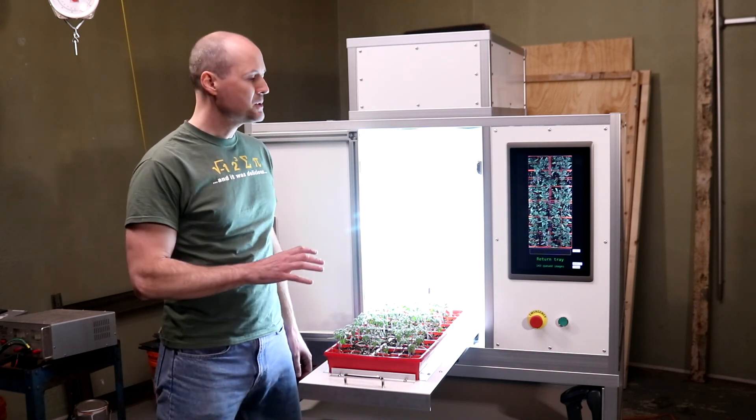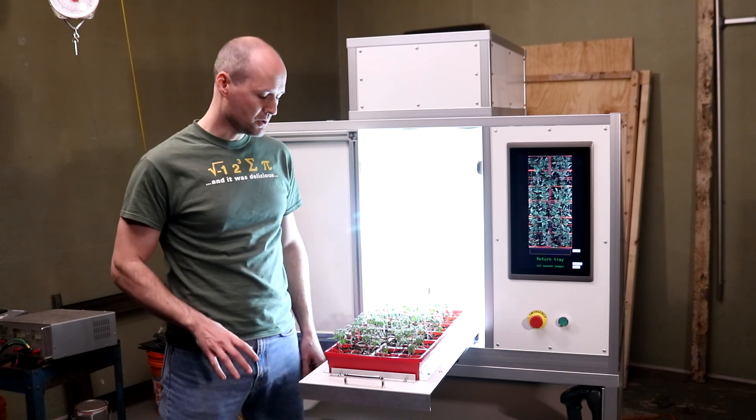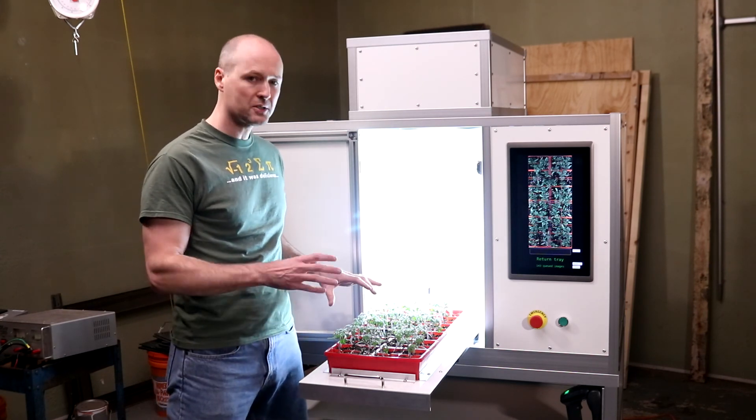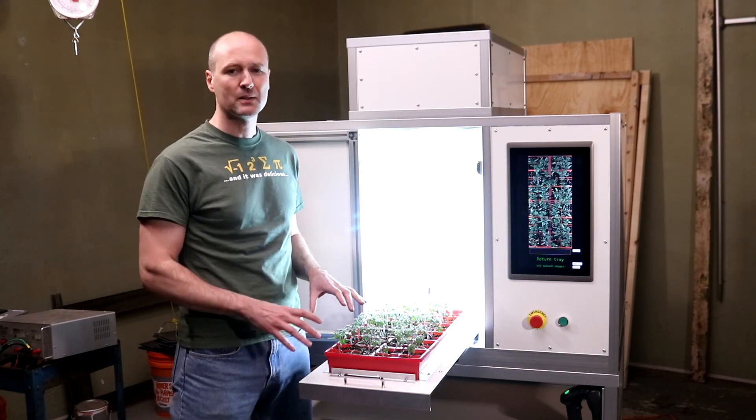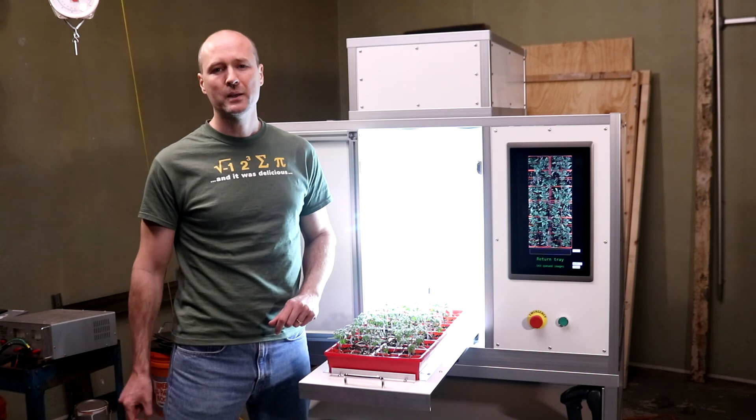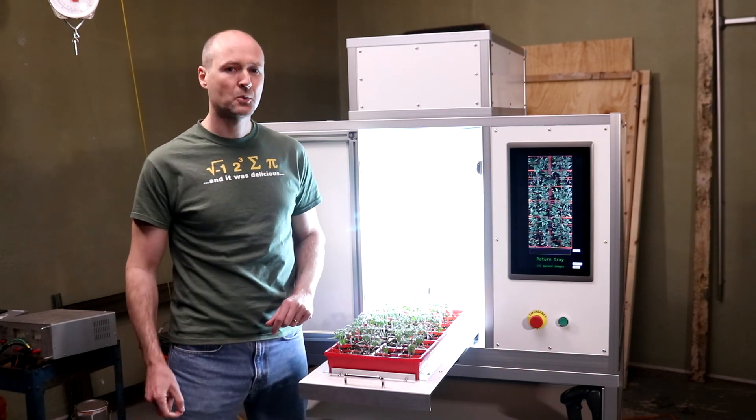I built this machine to help ag biotech researchers compare different treatments such as microbial treatments applied to plants in the hope that one of those treatments will help the plant to produce more food.